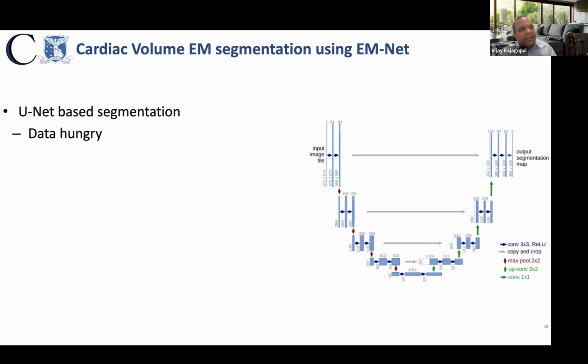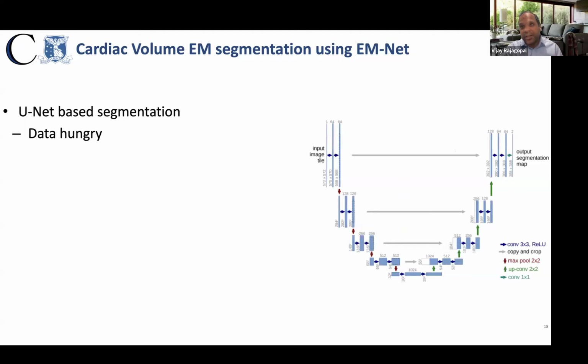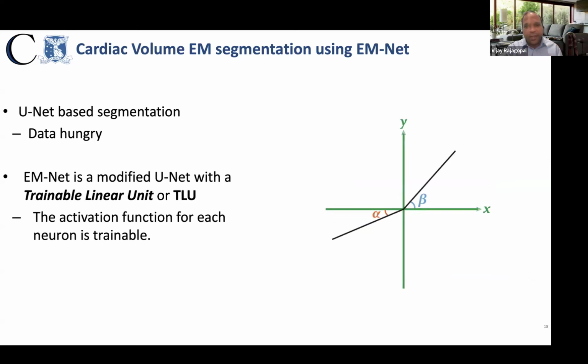My take on that was that not every lab is going to be able to do what they were able to do, hire as many summer interns as they did, or have access to the type of data that they did. So we wanted to really figure out what we can do with UNets that would help us with our work. And we don't have many people who can do manual annotations. So one thing we wanted to do is figure out, can you train a UNet with fewer data sets? So Afshin went away and tried a bunch of things, and he came back with a solution.